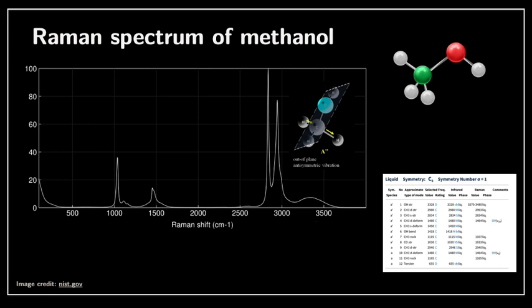And you can see that indeed all those vibrations are visible. Actually, they are also visible in infrared, it turns out, but they are visible in Raman. Sometimes they are not reported, like in the table on the right-hand side, simply because the intensity is too low. But all those vibrations are allowed; sometimes it turns out that the change is small. It is not zero by symmetry, but it is small, so we don't see it.